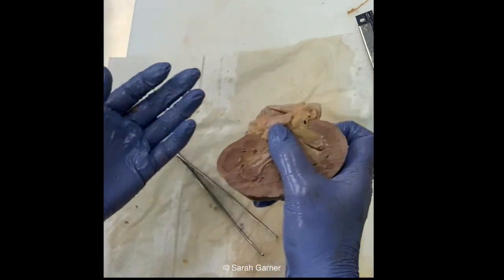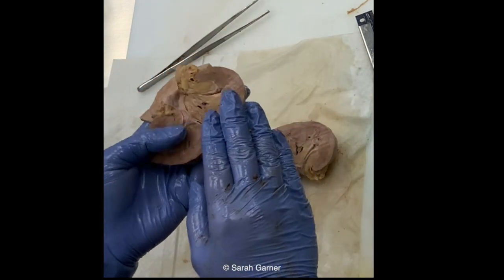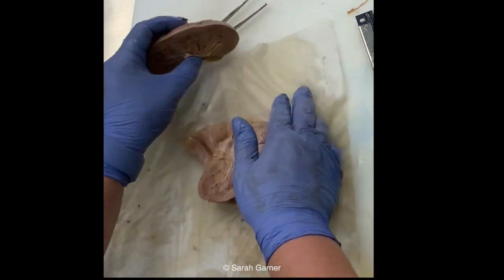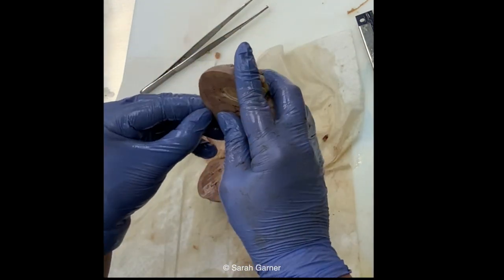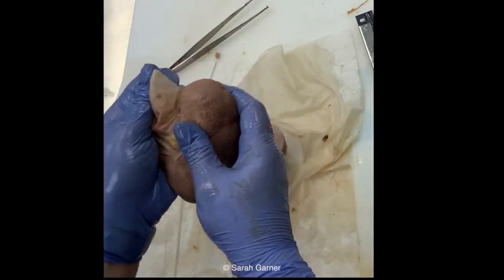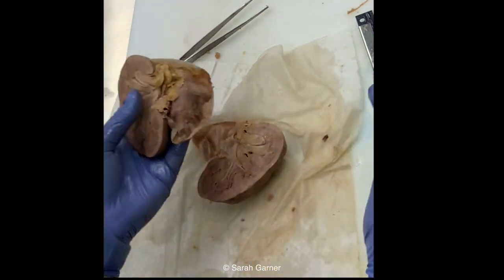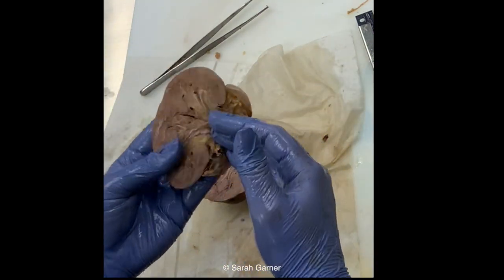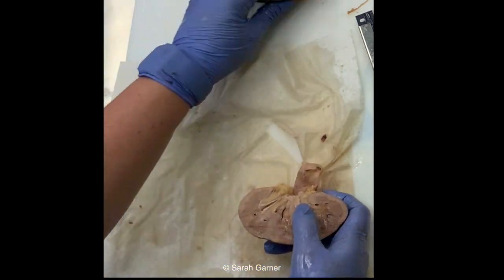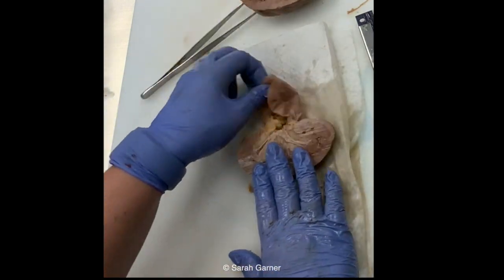So the reason for that, I mean, if you've taken systemic pathology, hyaline arteriosclerosis is gonna eventually give it that appearance. So you do the same thing on the other side. Again, once you've already cut it, you have that nice area to cut, and then you can kind of leave it attached. So that way, let's say you're doing this autopsy and somebody else comes, or maybe the attending comes and you're doing organ review and showing them what you found, you can show them, yes, here's the capsule, okay?